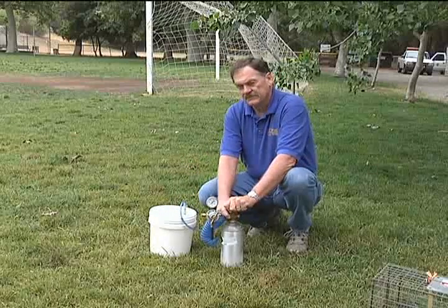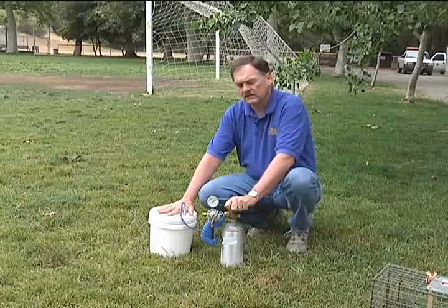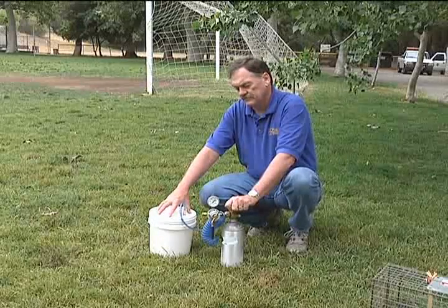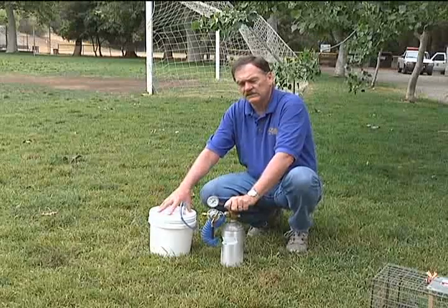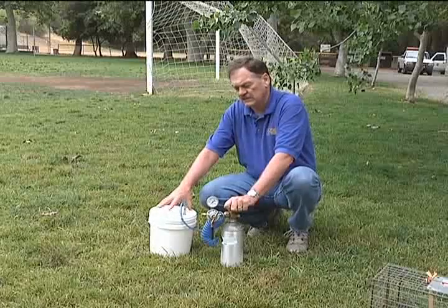Then slowly flow in the carbon dioxide. Usually 30 to 45 seconds of flowing in will fill the container. Carbon dioxide is heavier than air, so it'll stay in the container.